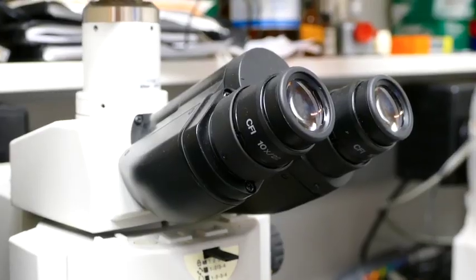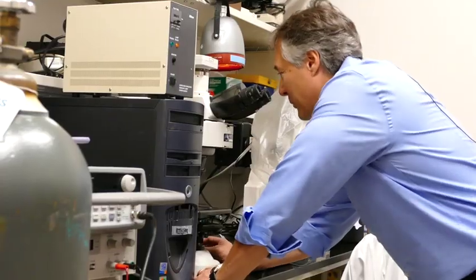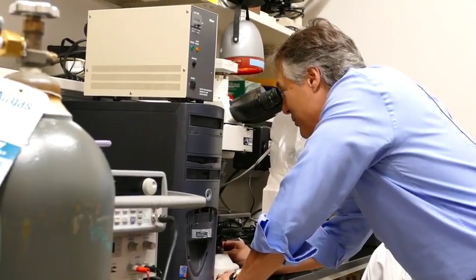Traditionally, sampling methods have a lot of subjective issues with them. There's no subjectivity at all. We don't have to look down a microscope and judge, is this a biological particle or not? Microscopy can have reasonable confidence towards identifying different species of airborne fungi. That's not always the most important information.